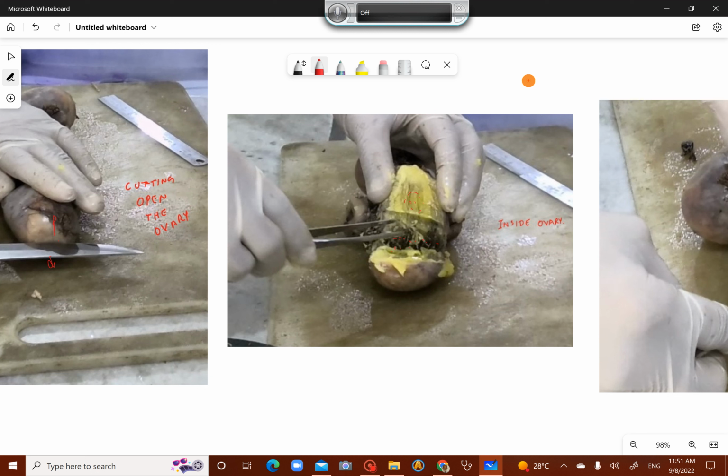A mature teratoma has the lining of the ovary lined by skin, epidermis, and all the dermal appendages. Because of the skin lining, there are lots of hair follicles. So this yellow material is sebum from the sebaceous glands, and these are hairs which have fallen off from the hair follicles, and they have accumulated because of the closed contents of the ovary. So this is a typical finding of a mature teratoma.